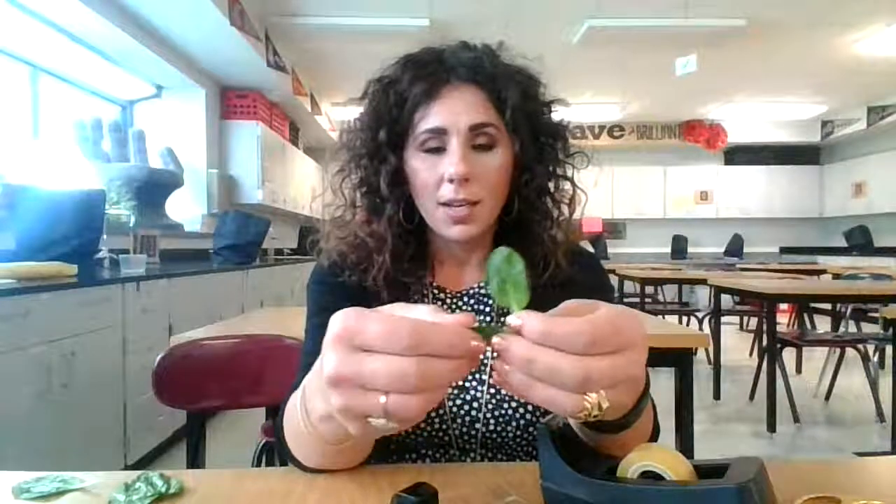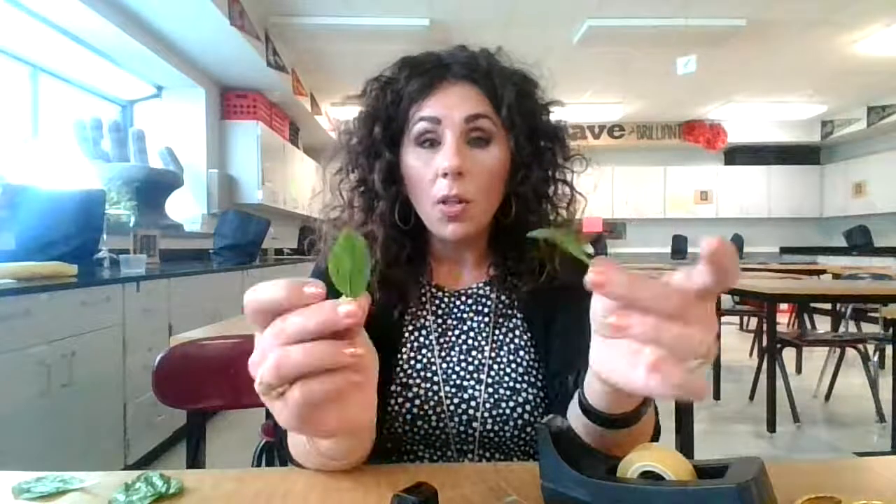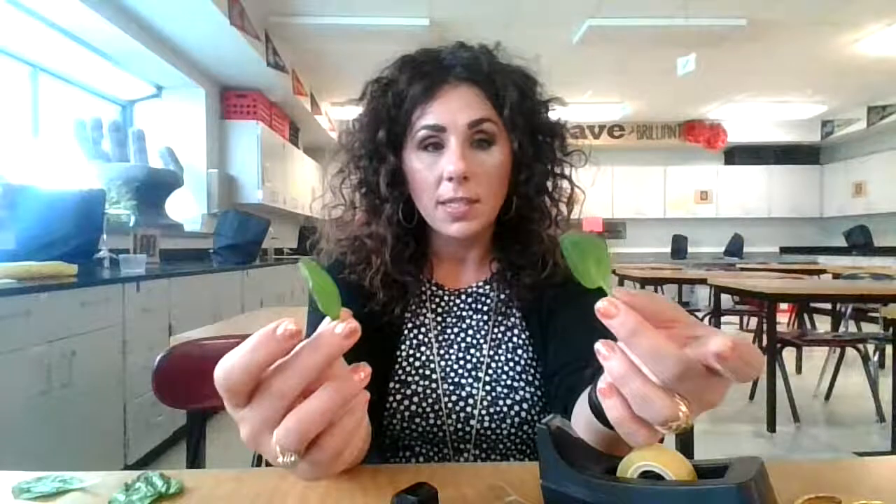We're going to take some leaves that I have here — spinach leaves actually — and we're going to pull off a specific layer of cells off of these leaves and explore what they look like under a microscope.